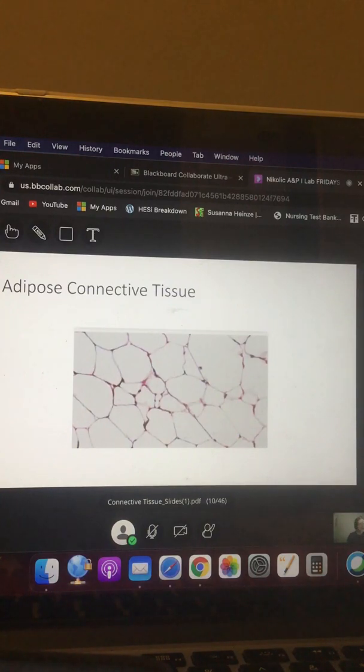Because notice that in that list, there are 4 things we want you to know: adipocyte, fat vacuole, nucleus, ground substance. We're not asking for the cell membrane. So be careful here, guys, right? So here, I'm going to ask for the adipocyte like this. Is that the cell membrane? Yes, it is. Do I want to know the cell membrane? No, I don't. So if you tell me that's the cell membrane, I won't give you a point because it's not on my list. And the reason for that is that I am going to point to the inside of the cell for the fat vacuole.